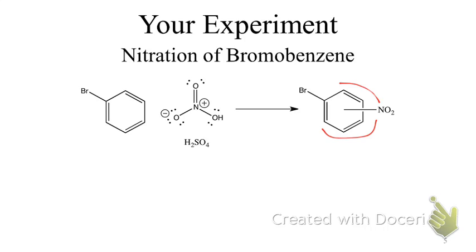If we did a reaction where it was an activator, our ring becomes more reactive, and we could see multiple substitutions. So we were kind of nice in the design of the experiment, making sure that we limit the possible products coming out of this. So we would expect 3 possible products. You get to identify what product you make and then explain why and how that works.